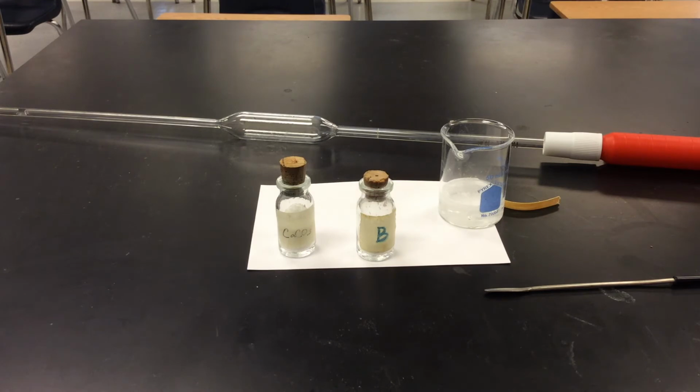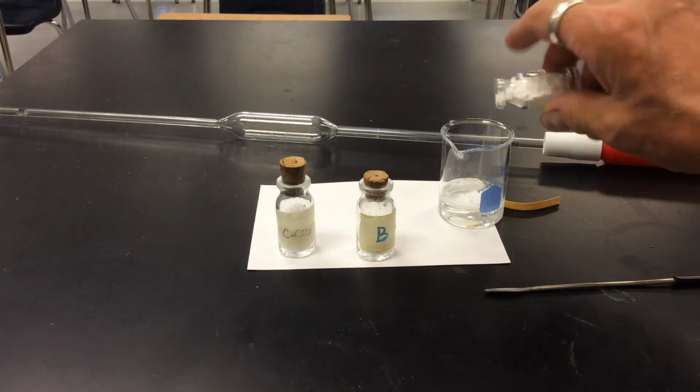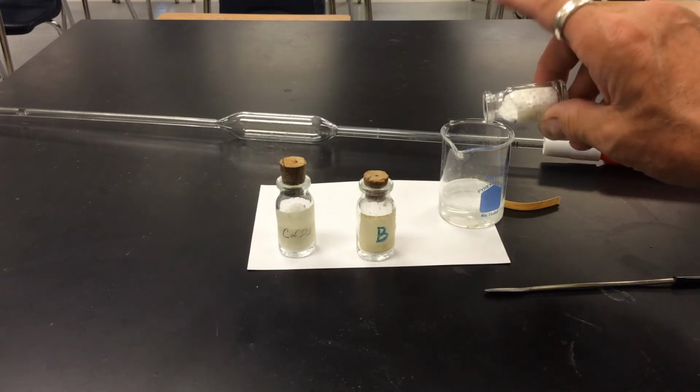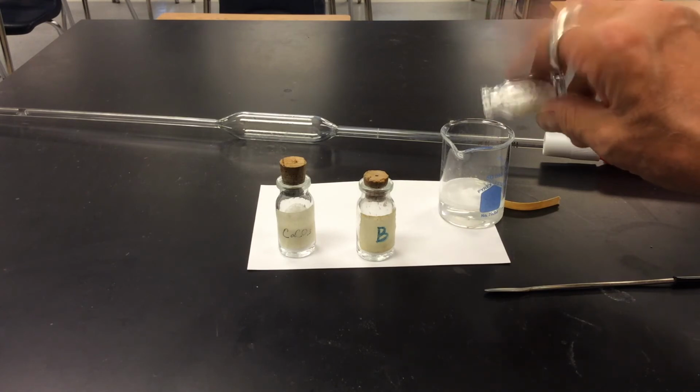They find out if it's exactly 1 molar, then they should have about half a gram of either magnesium carbonate or calcium carbonate. And they add, and eventually the reaction stops. Some students want to weigh this before and weigh this after. That's usually the best procedure. Others of them come up with some kind of random ways of doing it. Students are also not really good at knowing what is about a half a gram.